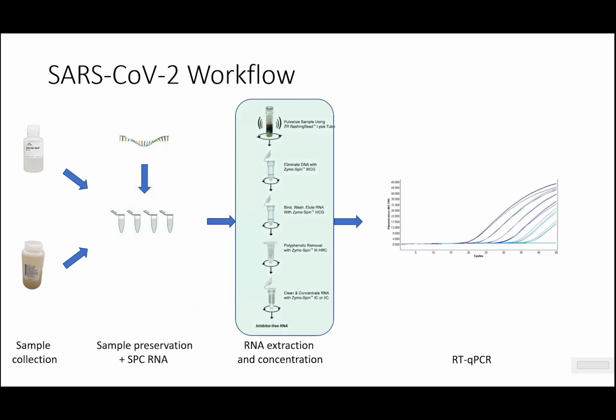Moving on to the RNA extraction step, the purpose here is to extract and concentrate RNA with minimal loss, and also to reduce or eliminate inhibition. We found that including the solids portion of the wastewater increases signal strength, which isn't too surprising. The SARS-CoV-2 virus has been shown to associate primarily with solids in the wastewater.